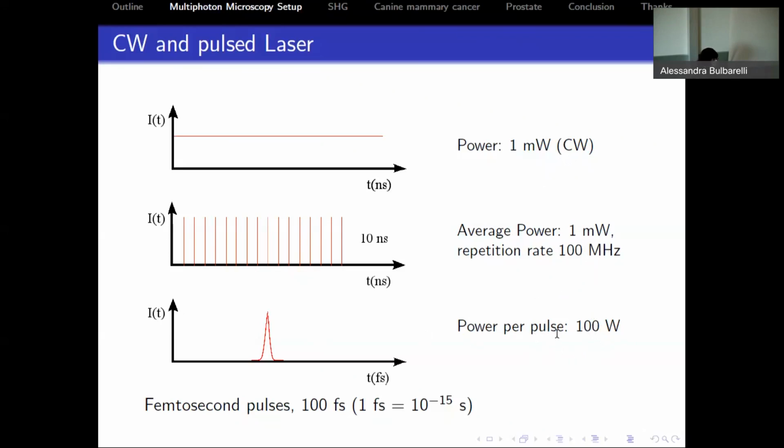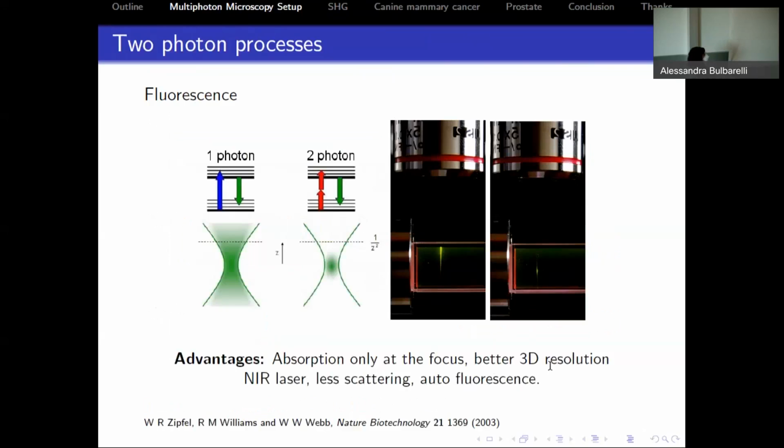And with that, we can drive a lot of nonlinear processes in the materials, because the electric field of these very intense pulses just perturbs very intensively the polarization or the absorption in the samples. And so we can do a lot of nonlinear techniques, which make it very easy to characterize details of the materials.